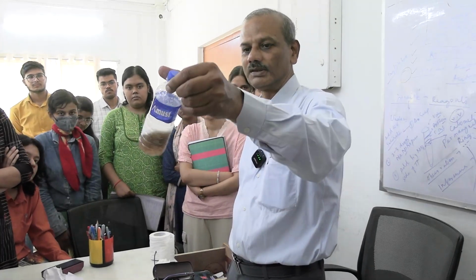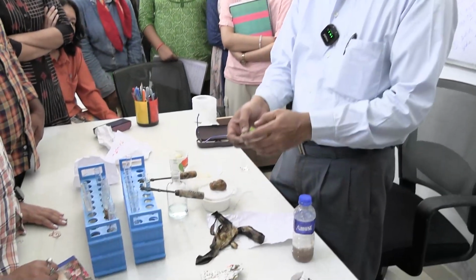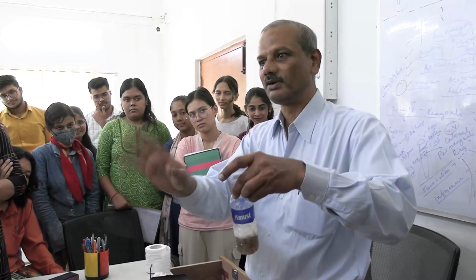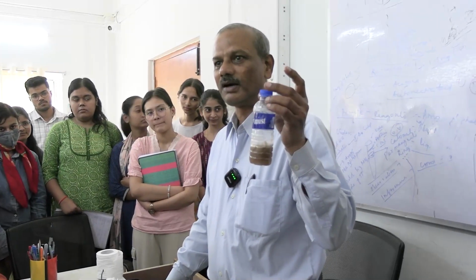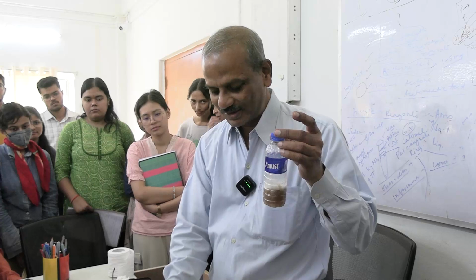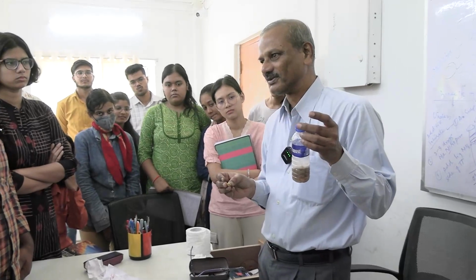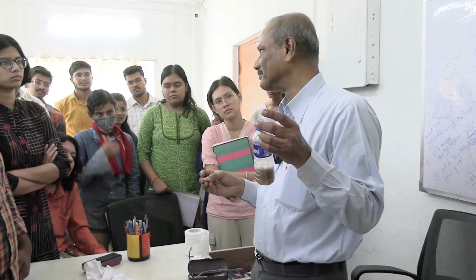Many sweet fruits. People are under the impression that if we take sweet fruit, nothing will happen. You see the banana, what is the state of affairs? I will put a little bit more water. I have taken only a small part of this one, because it was wasted for 2 days, and dissolved it and put the volume here, and you see what the concentration is. I checked it in the laboratory. This much I have taken and dissolved, and the concentration was 10,000 milligram per deciliter. So banana is a high risk food. So do not take too much banana. The blood glucose level will simply shoot up. Similarly, if you had brought dates, you could have seen what the concentration is in dates.